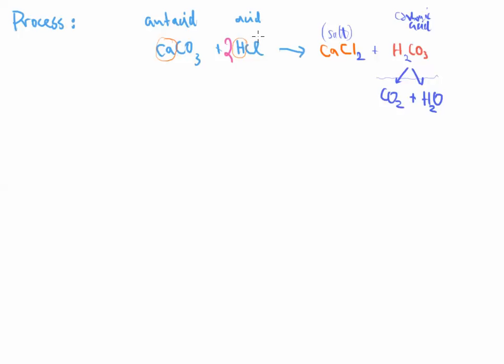All right, so this is the equation that is happening at the molecular level when you begin to titrate this reaction. All right, so let's talk about calculations. Now that we've got this background on the equation, let's talk about the calculations. And we're first going to start with the standardization of NaOH. Or I mean, not NaOH, but HCl.